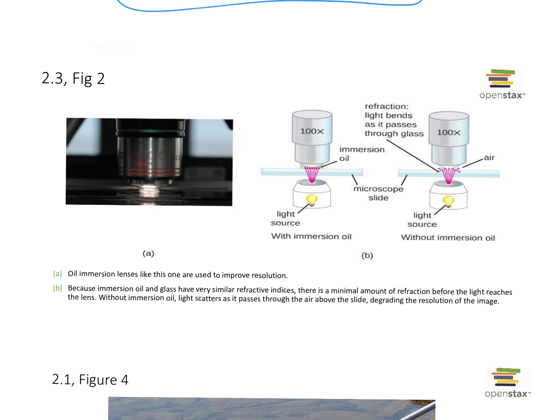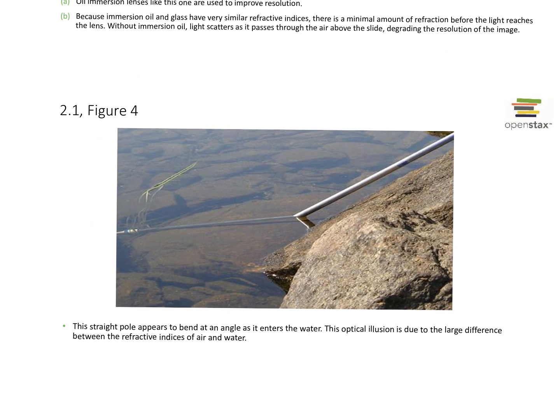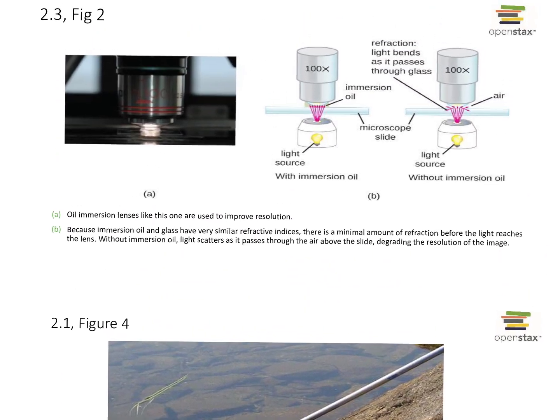Well, this involves something called refraction. So let me go on to this picture first. You have experienced refraction if you've ever gone fishing and dipped the end of your fishing pole into the water and noticed how it looks like suddenly your fishing pole bends off at a weird angle. Okay, you've just experienced refraction. Basically, when light waves are traveling through a medium and change mediums, when they go from the air to the water, they appear to bend.